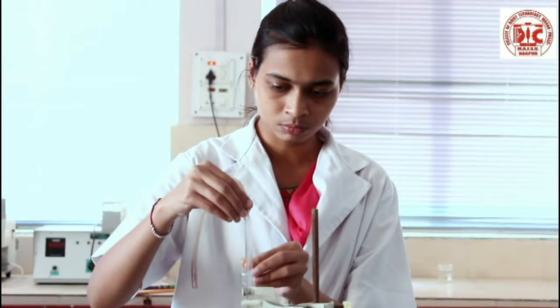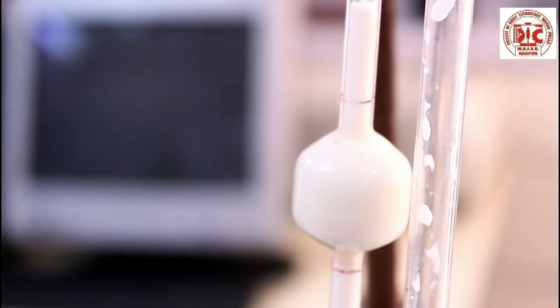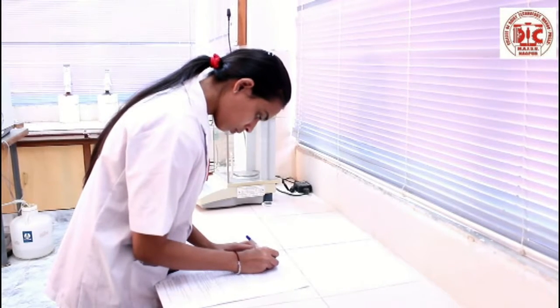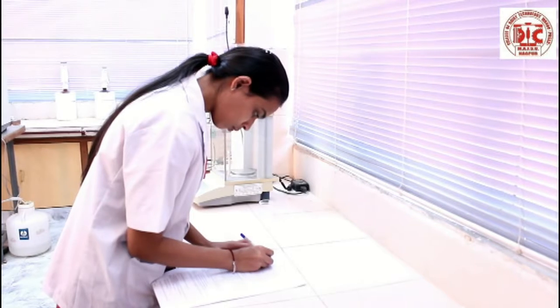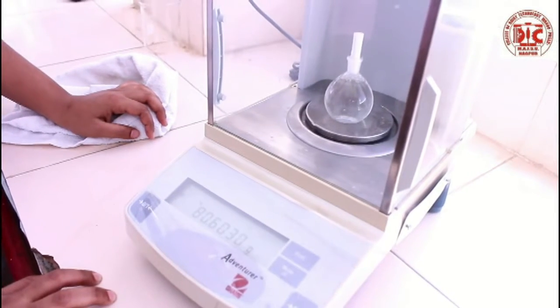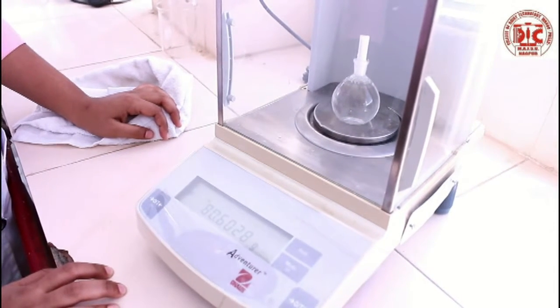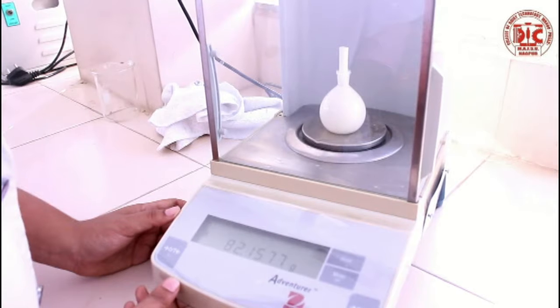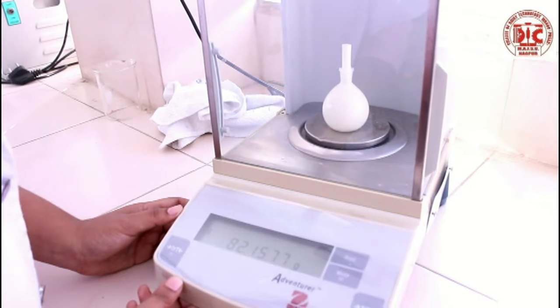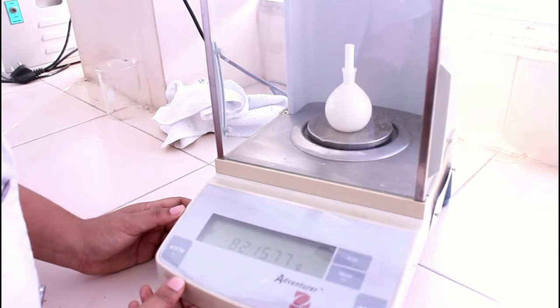Replace the viscometer in the bath and repeat the experiment with milk. Record the times for at least 5 observations in the tabular form. Measure the density of the milk sample relative to the distilled water used in the experiment at 20 degrees Celsius or 30 degrees Celsius, as may be the case.